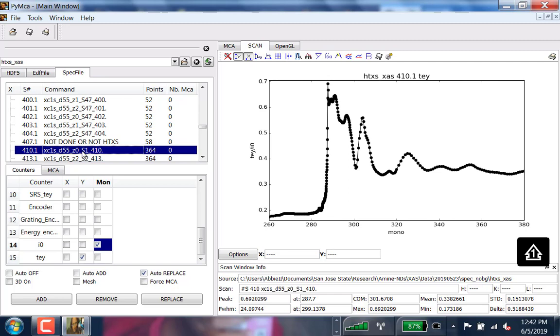I am not even yet able to get to the folder, honestly. No? Okay, let me pause here.